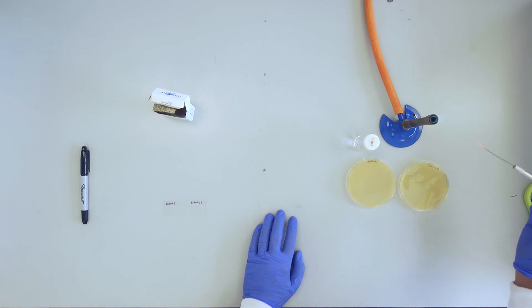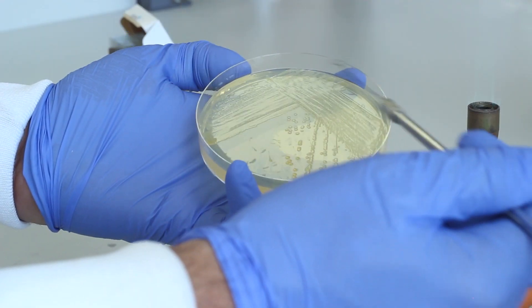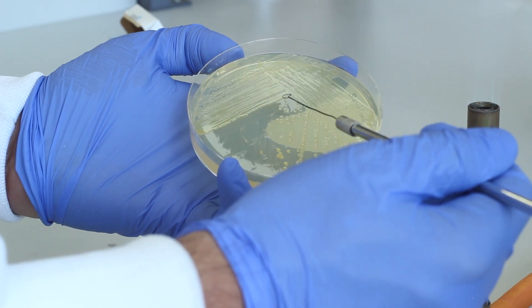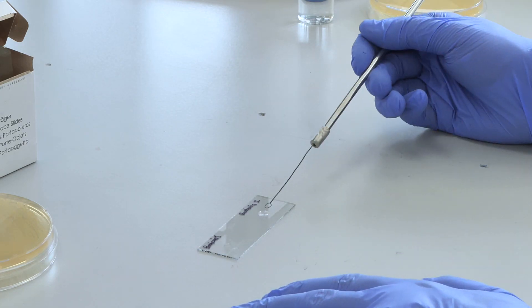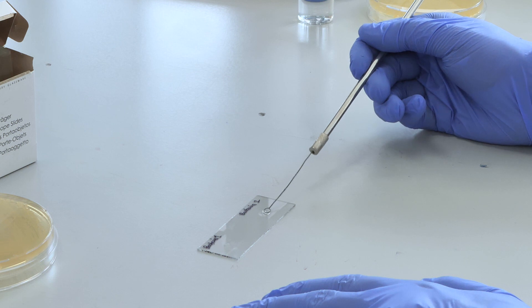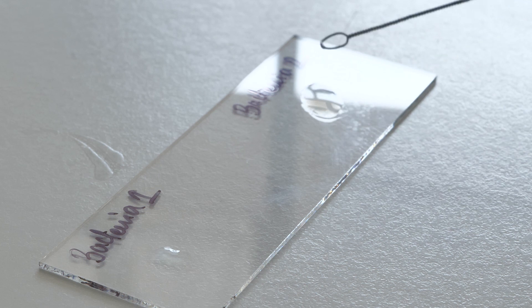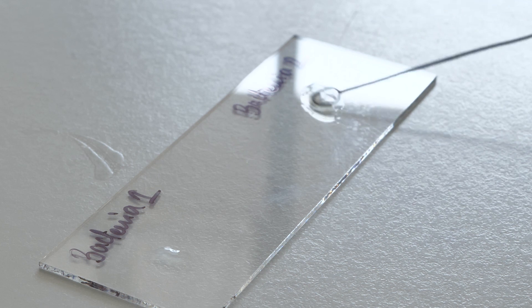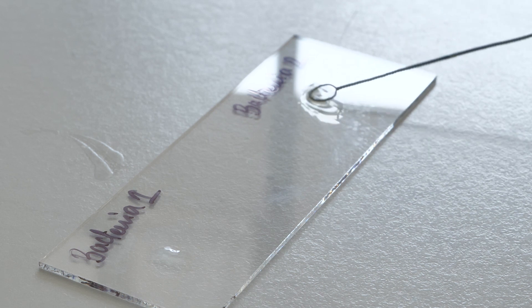Repeat the procedure for the second bacterium. A negative KOH test should be recorded if the mixture becomes cloudy but has no stringiness. This result is indicative of a gram-positive bacterium.